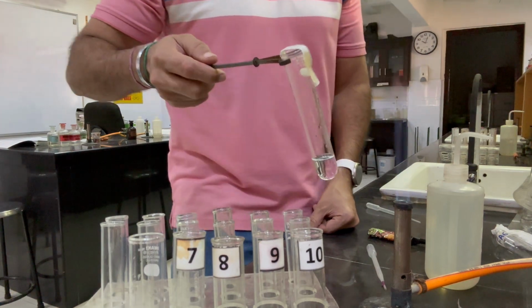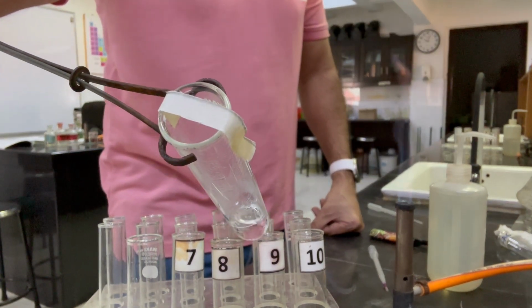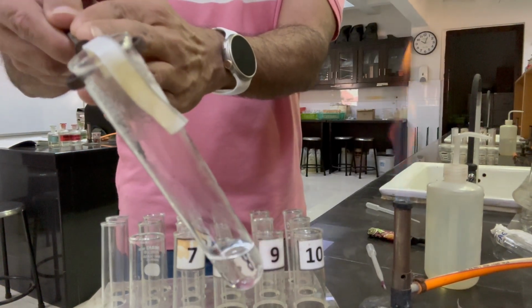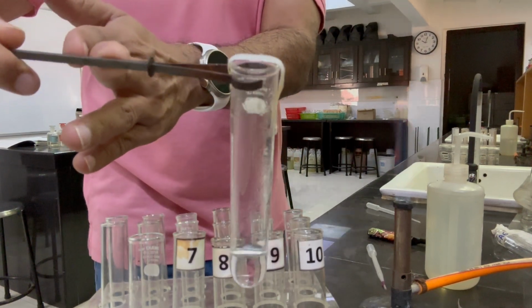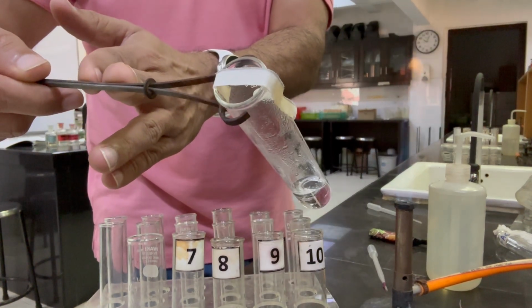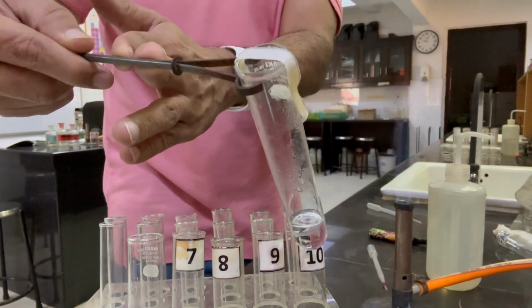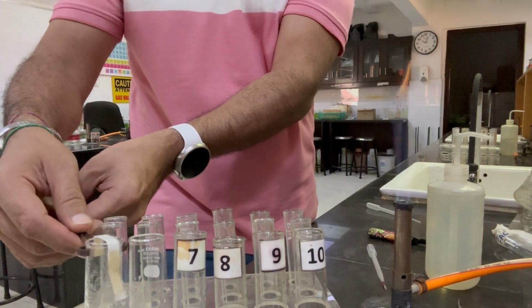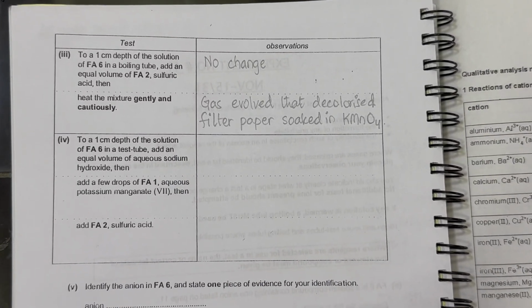So now we can see the exposed part is totally colorless, white, and the remaining part is brown in color. The exposed part being decolorized means sulfur dioxide has bleached this part. So sulfur dioxide is confirmed. So let's record this observation. So I have recorded this observation.